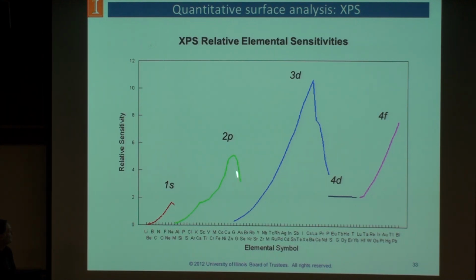So you can see that we can get quite sensitive to F orbitals or D orbitals. And F orbitals are increasing right here. But you'll notice I don't reach a peak yet. That's because we don't really have an atom that's heavy enough yet that I can look at to get to the peak. But if you follow this trend, way out here you'll probably get a peak in F orbitals, and we'll be very, very sensitive to that element. But that would probably be a pretty nasty element that you wouldn't want to analyze anyway.